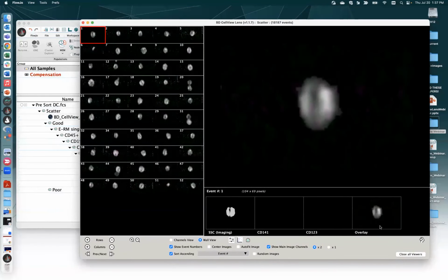Okay. There's a question. For what I understand, you need to set the image settings, brightness, and so on, prior to recording on the Discover S8. FlowJo probably has to play with those parameters afterwards, but the starting images will have the settings set in CellView. Stefano, yes, you're exactly right. I don't have the CellView software handy right here, but you've got a very similar set of tools there that you can set the images up. And then right in FlowJo afterwards, you can tune them if you would like.